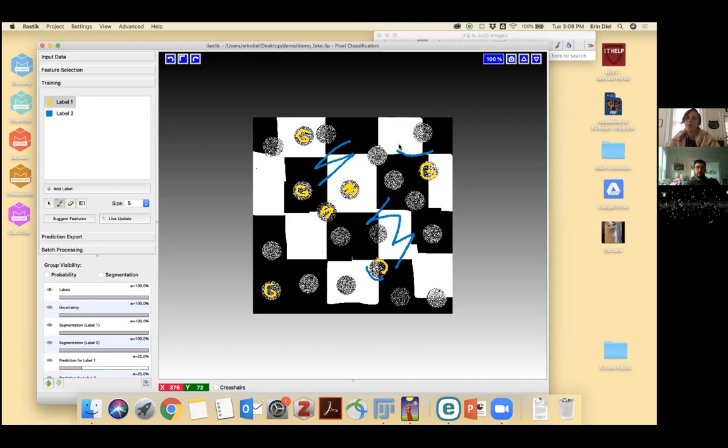And so you might want to take that into account in order to teach the algorithm some rules on how you might segment this from this background as well as this background, for example. That's one of the key parts of implementing machine learning for segmentation. Not that you always have to do this, but for image segmentation, what people have found works really nicely is not only taking the information in this image as it is.